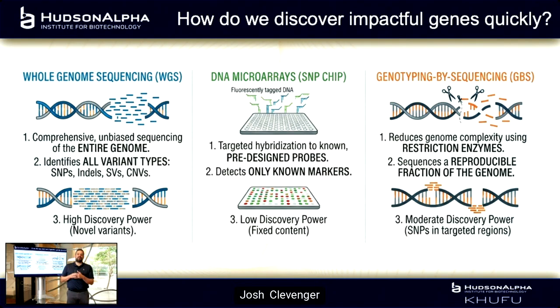There are 3 main genotyping mechanisms at the moment that you might go and work with a company or do yourself, or work with a colleague at your university to help do it for you. So they essentially have 3 different categories, and there are different flavors of them. One that we know very well are DNA microarrays. In my career, I've developed 2 different arrays for peanut.